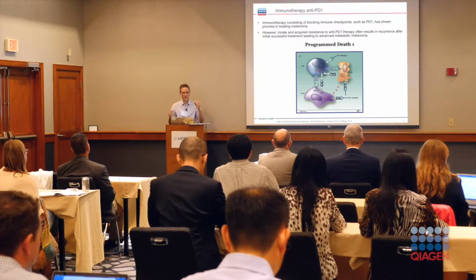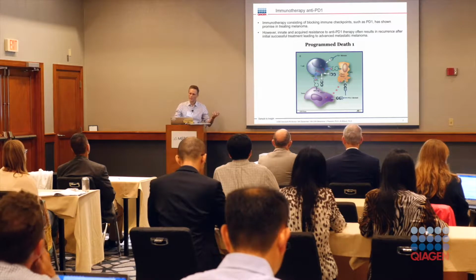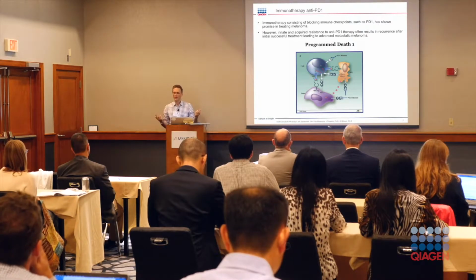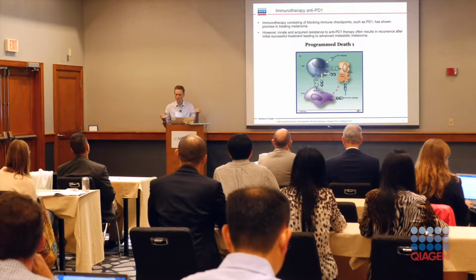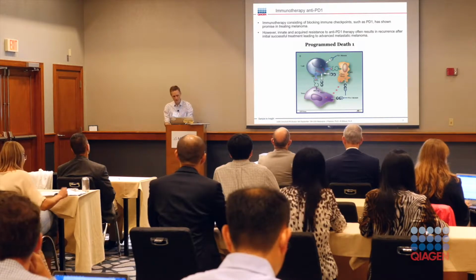There are certain people who respond very well to this treatment, and there are others who do not respond very well. And it would be great to be able to actually predict the people who would respond versus not respond ahead of time, and that's what we'll be focusing on today.